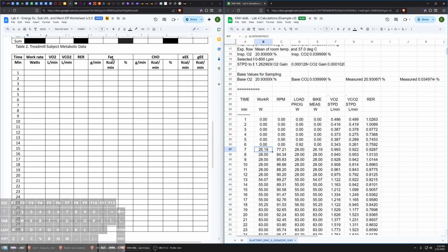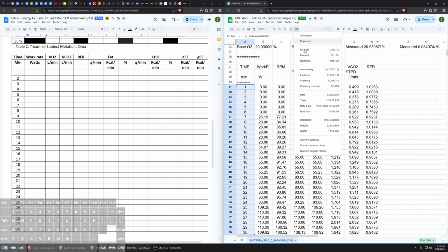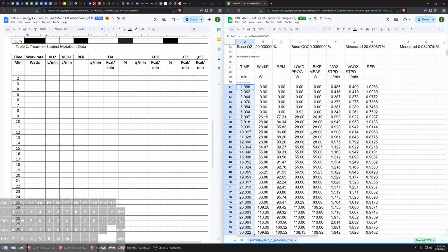So I'm just going to go ahead and get my table set up. I've already done a couple things here, such as minimizing the amount of what's available. So if you wanted to, you can come here and just be able to show less. Makes it look a little bit prettier, easier to look at. Because, I mean, you can see this has 15 digits past the right side of the decimal place. That's a lot. That's too much to look at. Go ahead and make things look a little bit prettier before getting started.